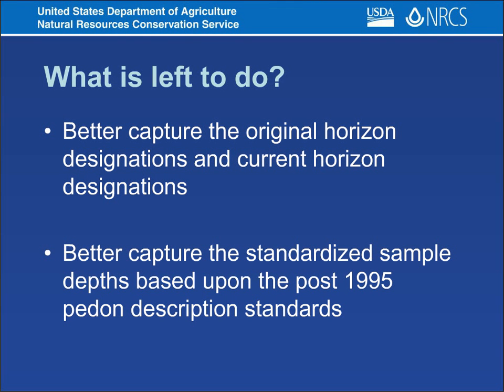And the other thing that's happened is over the years, we've changed how we describe soils, and we've changed how we've described where we've started the top depth of the soil. At one time, it was the top of the mineral, and now it's the top of the first organic soil layer that supports life. And so our database has been around for decades, and it contains a mixture of these depths and a mixture of these horizons. And there's an attempt to try to make a little more sense.